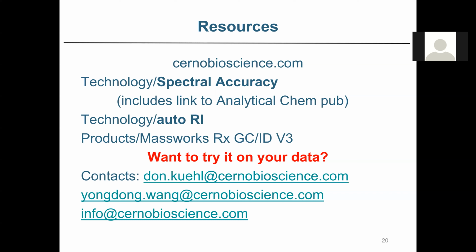Another question that's coming in is: if you use the alkane ladder and somehow misidentified, because you might have associated the wrong carbon number for the retention index calibration, do you have to reprocess the whole run after adjusting the ID?